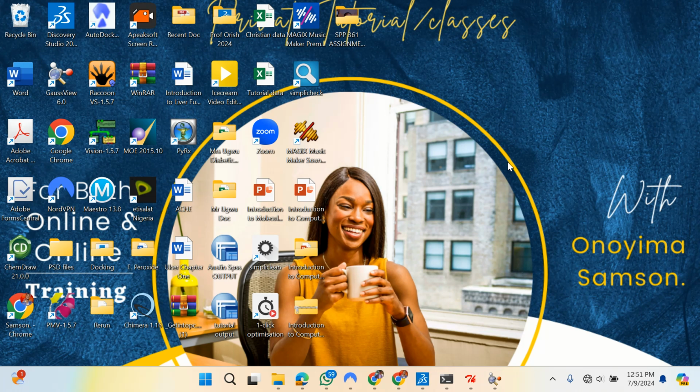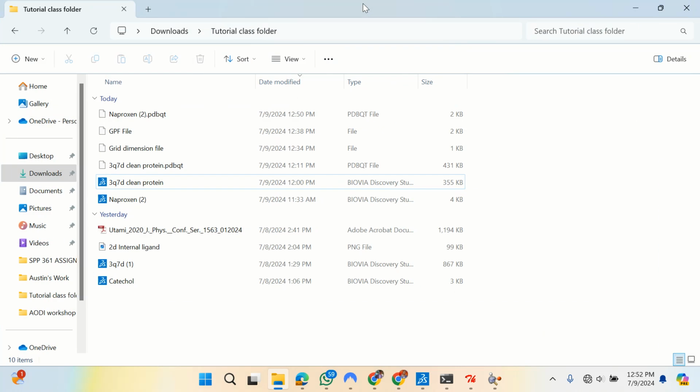Is that all right? Okay, so we can continue. We're going to prepare the config file, right? Okay, and as we know, this config file is going to be a file you prepare just once. The config file I've used for over 100 times was just prepared once. The next thing I'll be doing is just to edit it and work with it, right? Okay, this is an example of a config file.